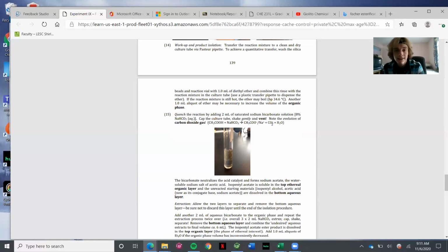So if you have unreacted acetic acid left over, you don't want that to be there, because acids can break esters. Esters on drugs actually are the very first functional groups to break once they get in your body. That's part of something called pharmacokinetics. You guys will learn about it your 4th or 5th year. I think 5th year maybe, in a PharmD.